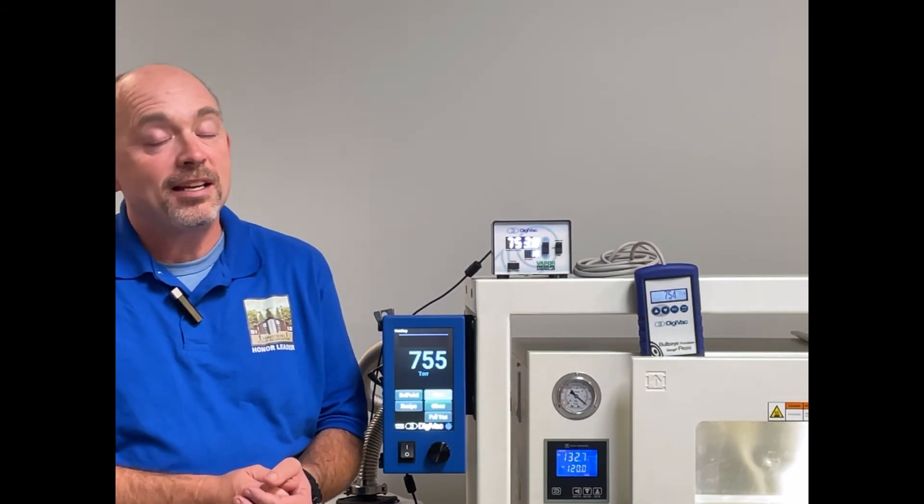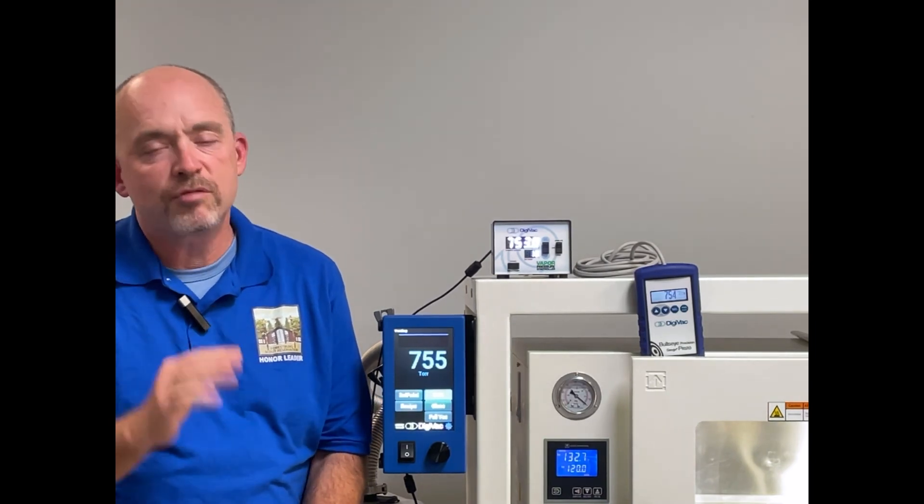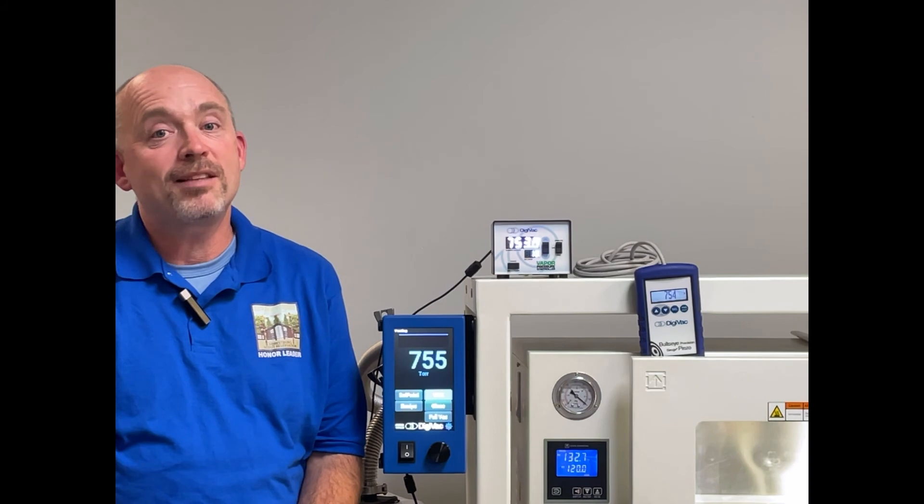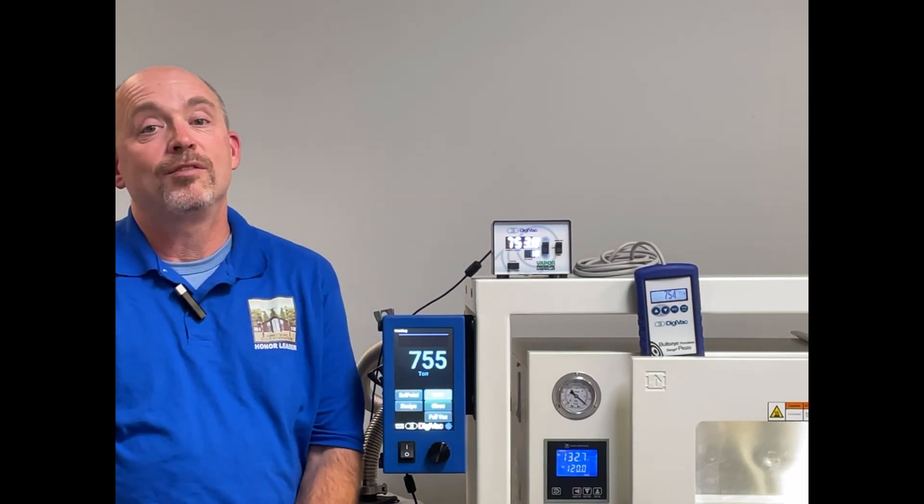But with automation, just saying 'okay, start this process,' there's much less room for error in something as simple as that. That's the high level of how vacuum control can really help in drying powders.